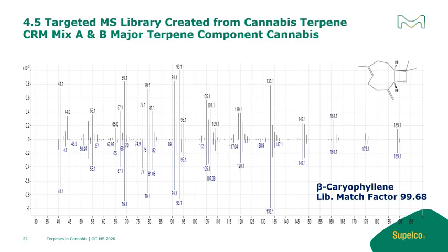If you perform full scan analysis during GC-MS, you have the ability to create a customized mass spec library, which allows for faster analysis time because you're using a shorter library as compared to using the complete libraries to search. It allows for retention times to be saved as part of the library, and it facilitates analyte identification.